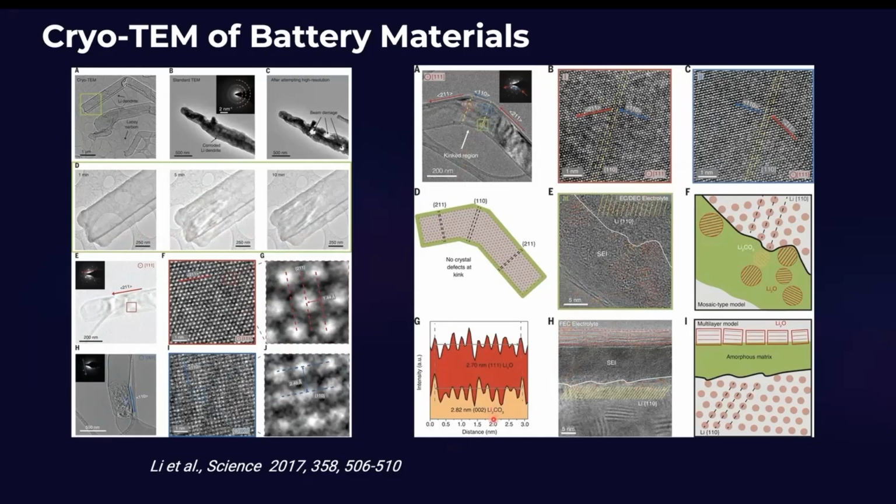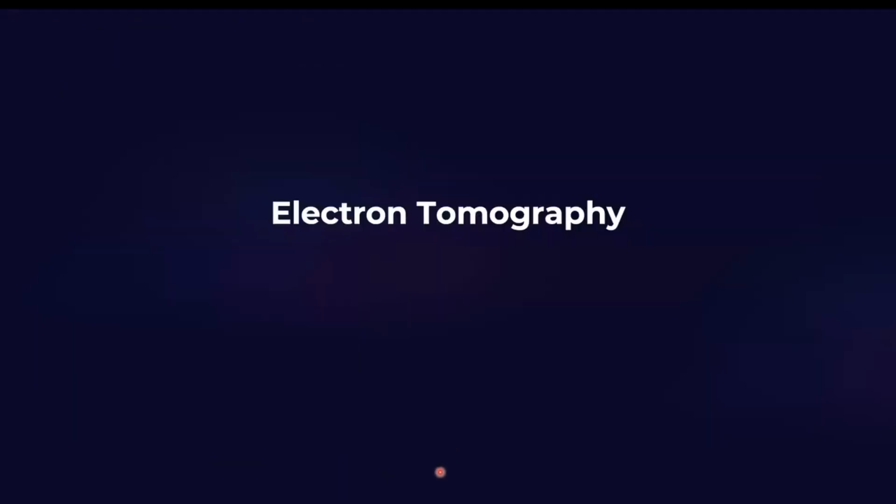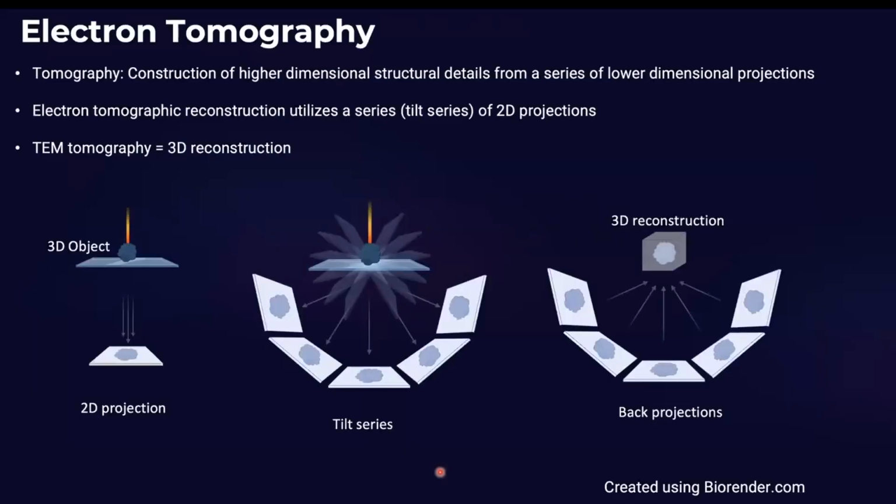So the impact of cryo-EM is massive. Now I will move to the final part of this, which is tomography. I already showed you the images of the shadows. Now it's the same in TEM, but the solution is particularly useful for those particles and self-assembled structures which are not necessarily atomically precise but have very complex structures. And this is where tomography comes in.